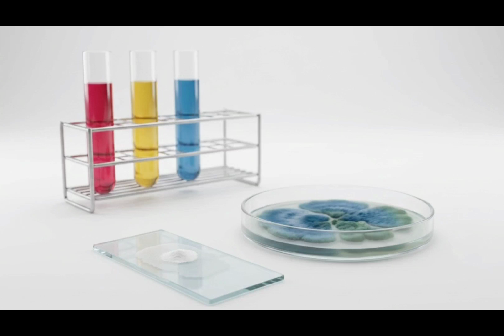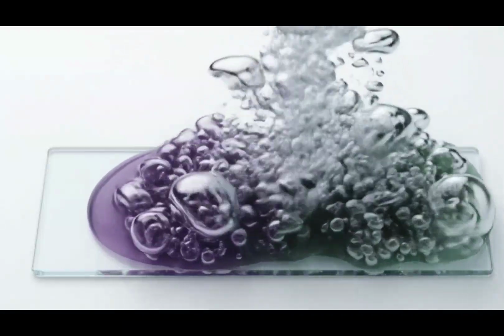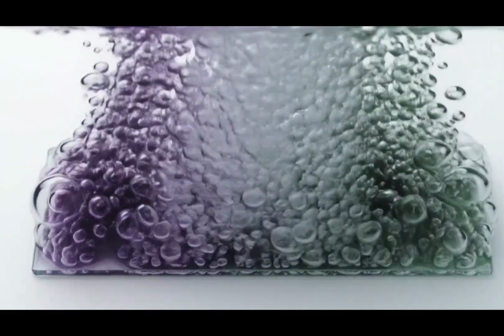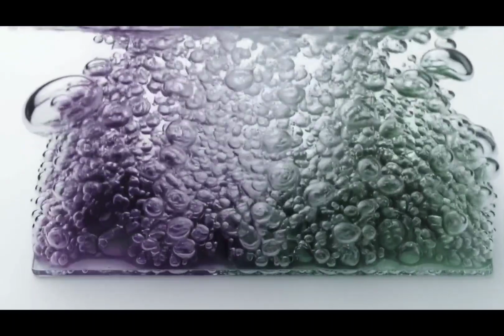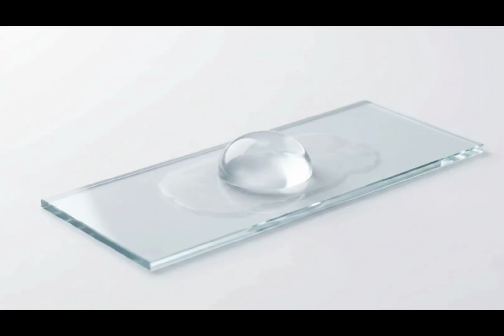We begin with the Catalase Test. Take a glass slide, smear a sample of your bacterial colony onto it, and add a few drops of hydrogen peroxide. If the organism produces the catalase enzyme, you'll see an immediate reaction. The enzyme tears the hydrogen peroxide apart, causing a sudden, violent effervescence. If you apply the drops and the liquid sits flat with a complete lack of bubbles, the enzyme is entirely absent, yielding a negative result.